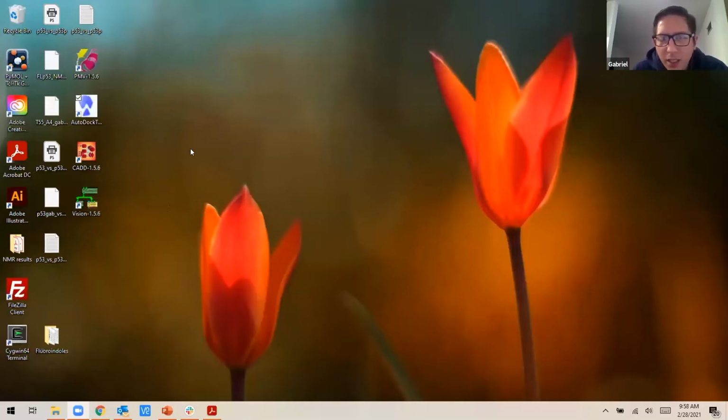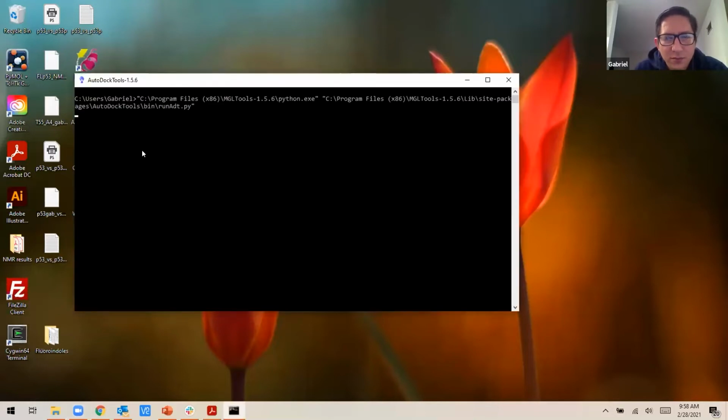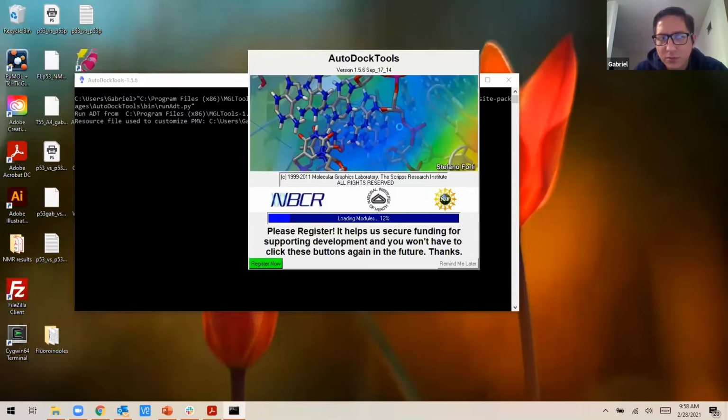Going to share my screen, sorry. So I'm here in my desktop. So I'm going to open Autodoc. So open your Autodoc Tools.